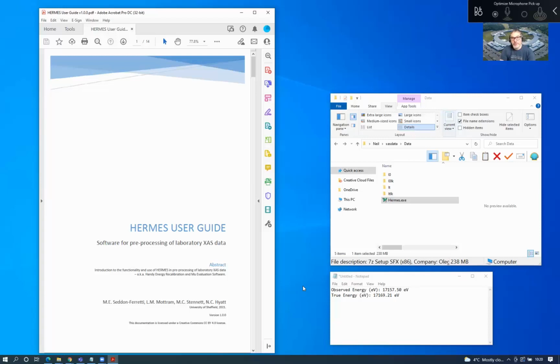And in this video tutorial, I'm going to take you through some of the functionality of the HERMES software for pre-processing of laboratory X-ray absorption spectroscopy data. The HERMES software is accompanied by a comprehensive user guide, and I encourage you to refer to this as we go through the tutorial. It also contains instructions for downloading and installing the HERMES software.